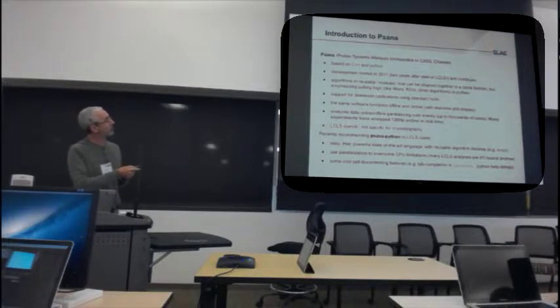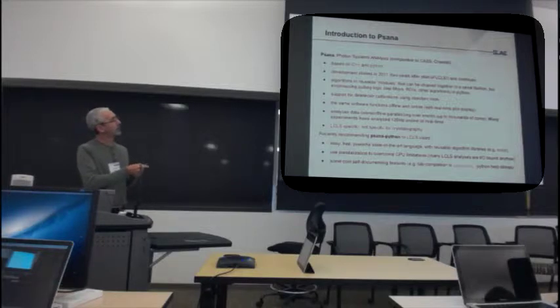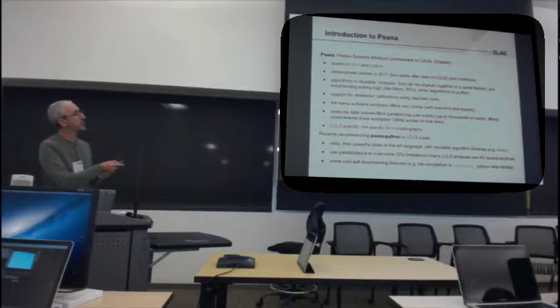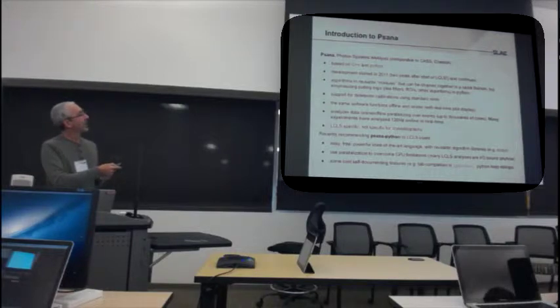It's this photon systems analysis. It's maybe comparable to what you've heard about CASS or Cheetah as being kind of a low-level thing. You can write your code in C++ if you're feeling masochistic, or Python if you want to do things slightly more slowly, although you can do pretty well with Python. And you can buy your way out with parallelism, because LCLS has thousands of cores now. We got 2,000 cores donated to us about a year and a half ago. And they sit idle a lot of the time, except for mostly Nick. Nick likes to use them.